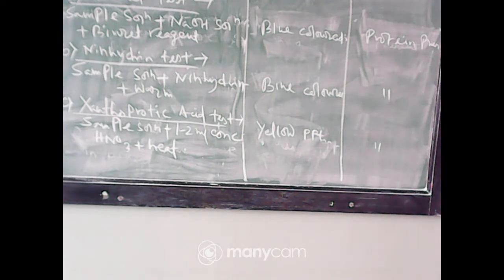Okay. Next is the test for fats. If you have completed, inform me.